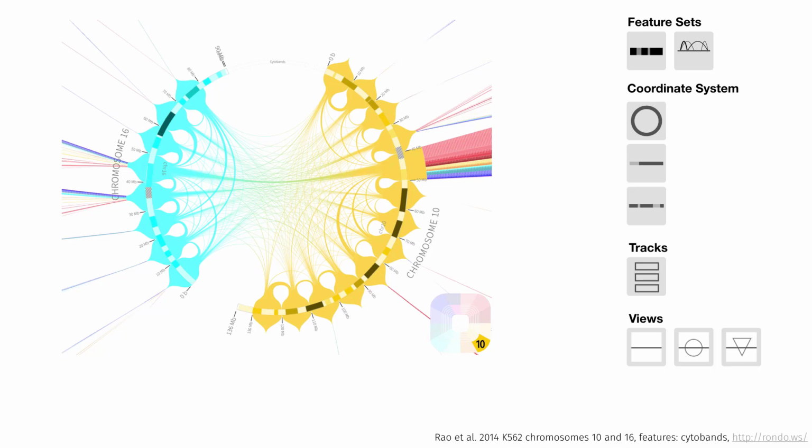And in this case, they had to set a cutoff value for interaction levels, and that's why you basically see these segments here. The second thing you can see is there are, of course, also these longer range interactions between different parts of the chromosome, but also interactions between the chromosomes. Now, the thing that you can see very easily here is the interactions between the chromosomes. In this case, because of their filtering approach, there seem to be a lot of them, but they're most likely, to be honest, not very relevant. There might be one thing, though, between chromosome 10 and chromosome 16, this stronger band here, where we might have an interaction that's actually relevant.